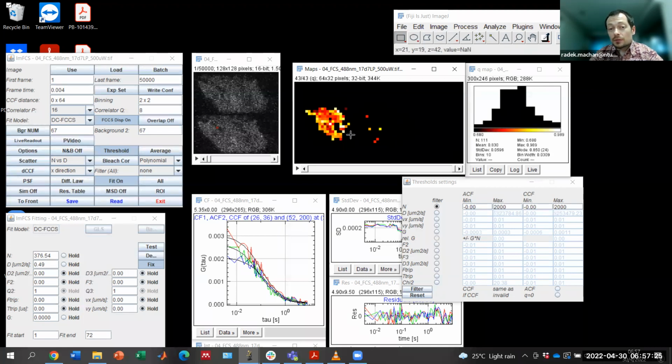So you see that, of course, in this case, the cross-correlation amount is high, which is what we expect. Here, before the cross-correlation amount map are the maps of valid pixels for the cross-correlation and the autocorrelations.